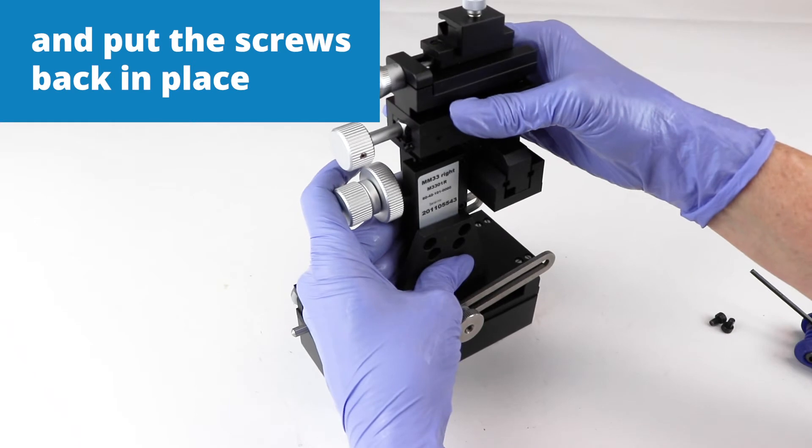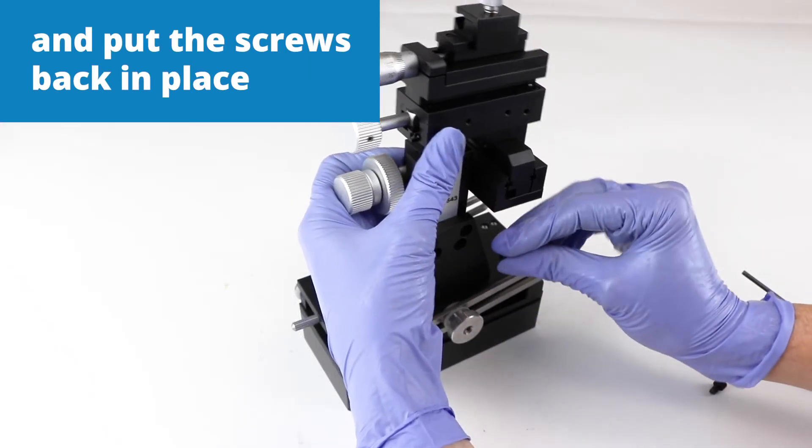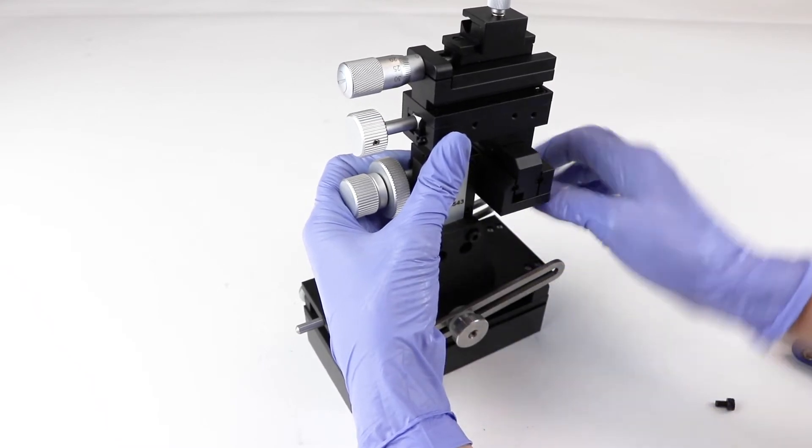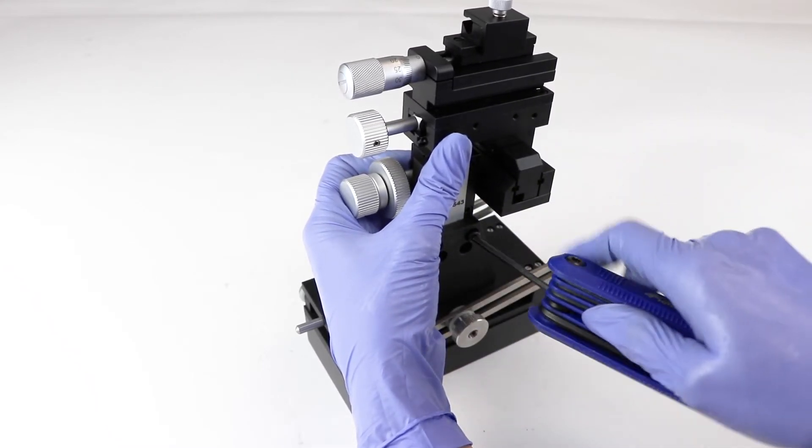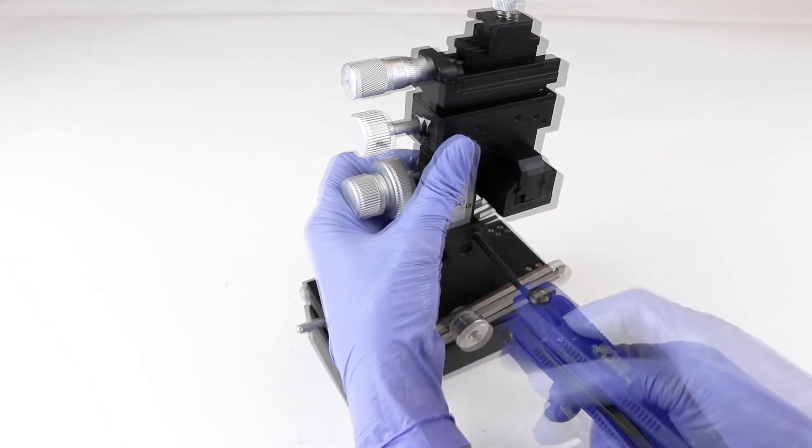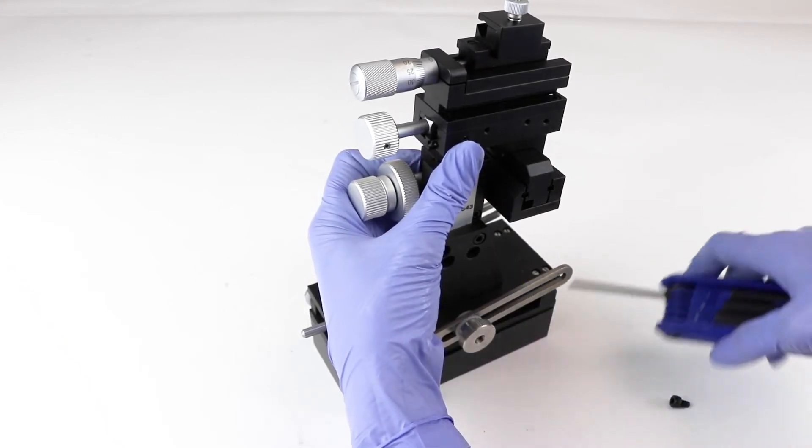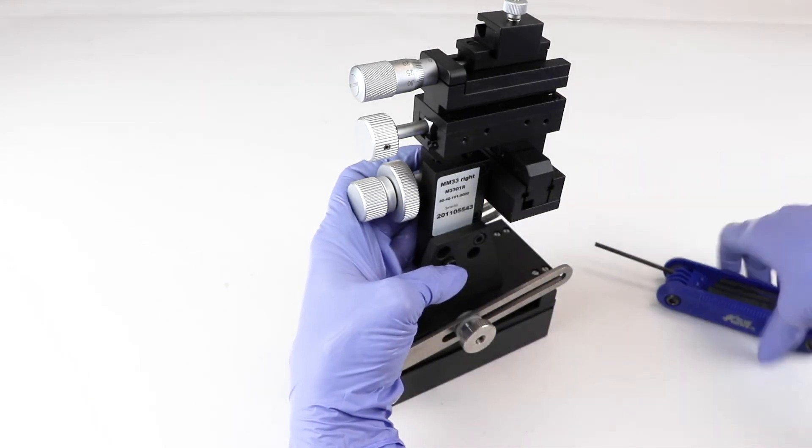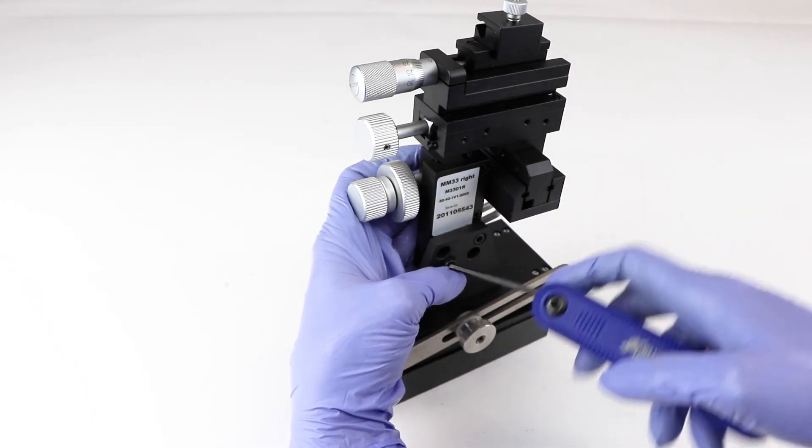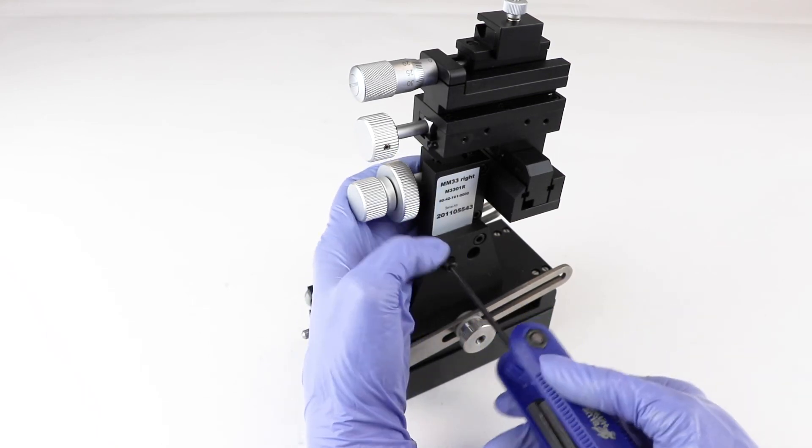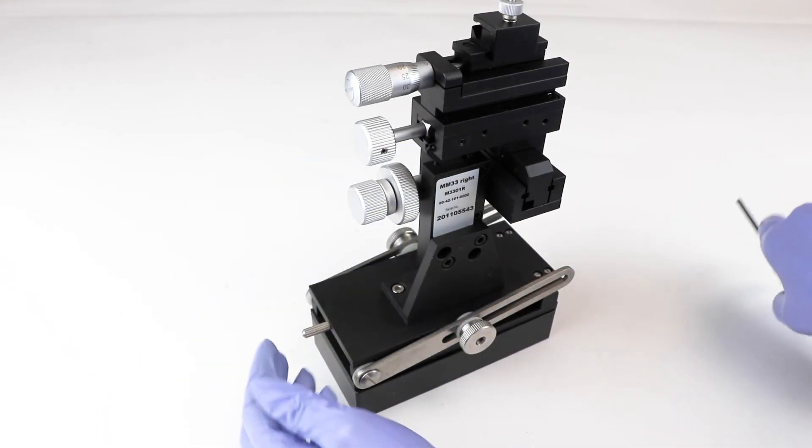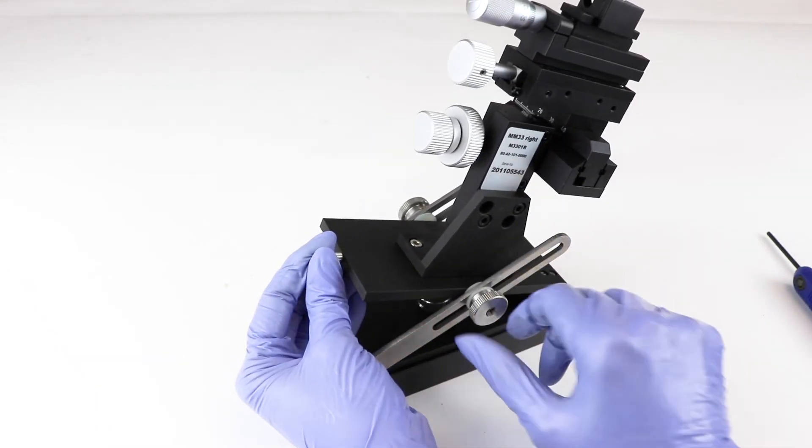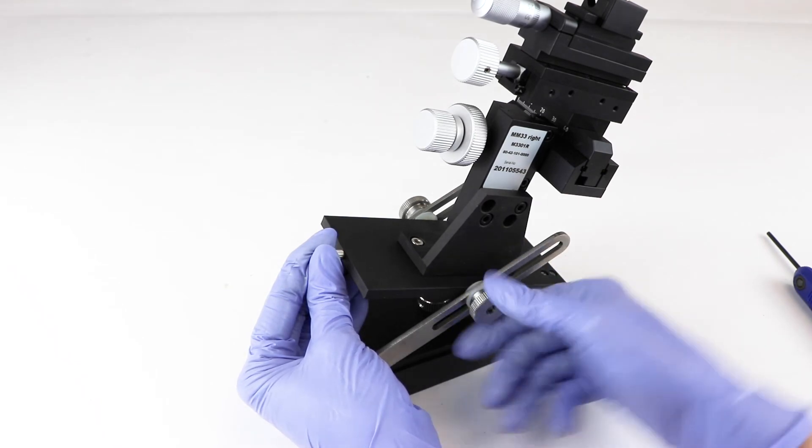And put our screws back in place. There we go. Now we can position the manipulator where we want and tighten it down in place.